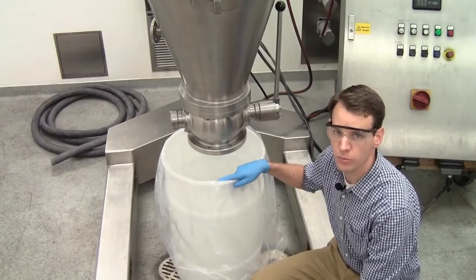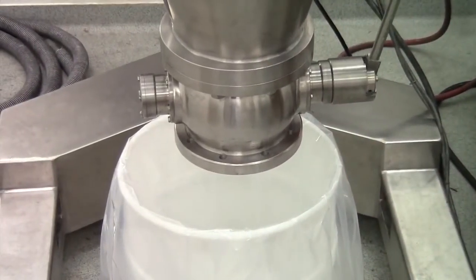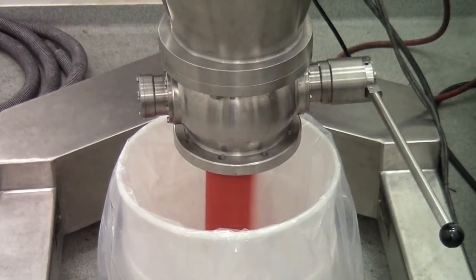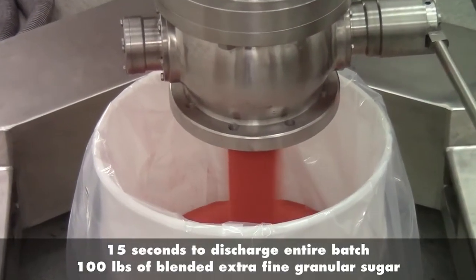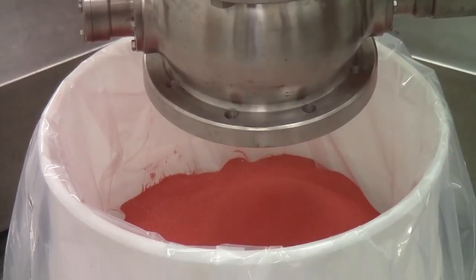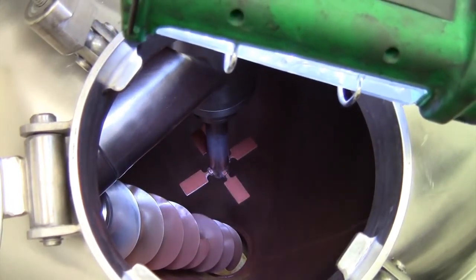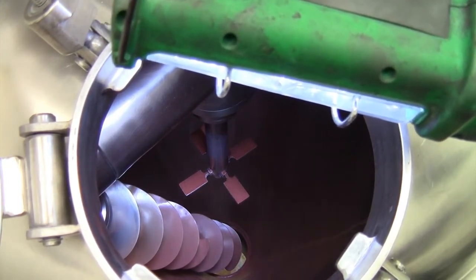We're going to discharge the material from the mixer now. Looking inside the mixer, you can see it completely empty due to the conical shape. There's a small residue of iron oxide powder on the walls, but there's no buildup of material inside the mixer.